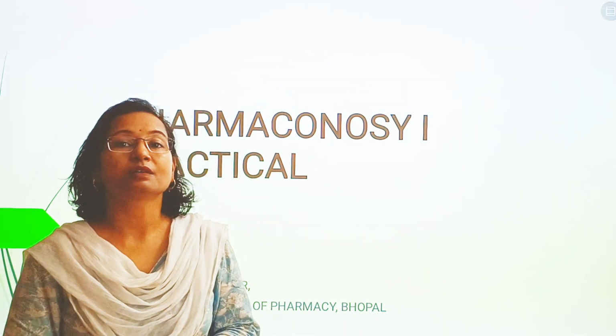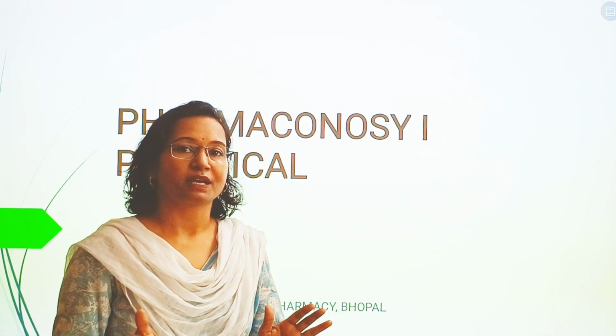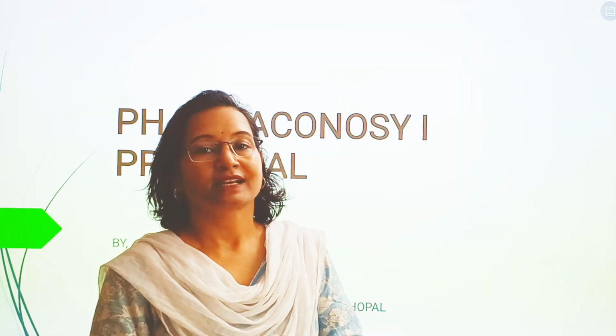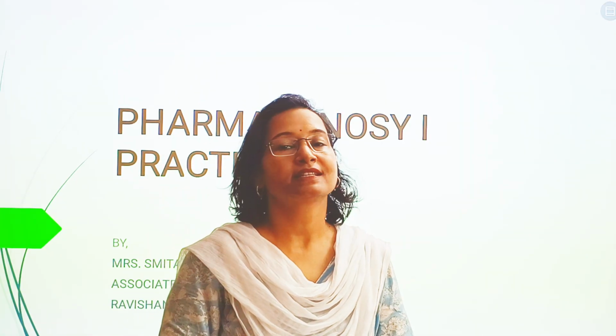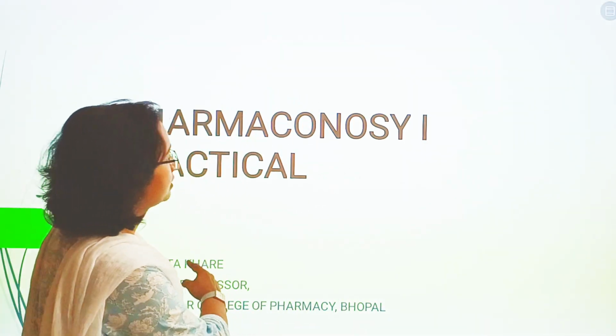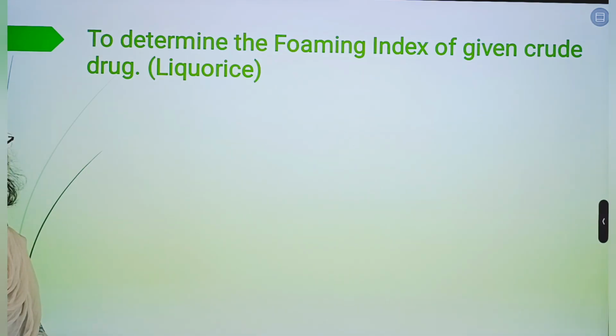Today we are going to discuss the physical evaluation. Physical evaluation can be done by various methods, namely moisture content determination, ash value, extractive values, swelling index, foaming index, etc. Our objective today is to determine the foaming index of the given drug. The drug we are using is liquorice.